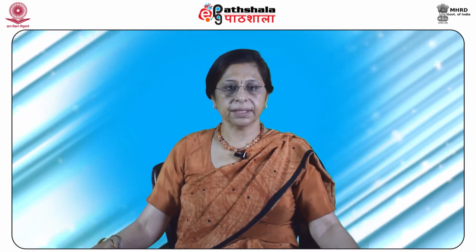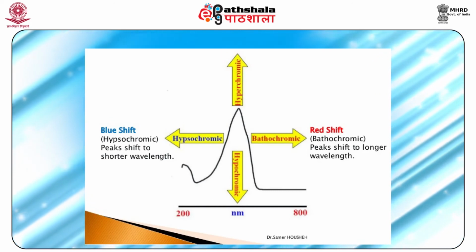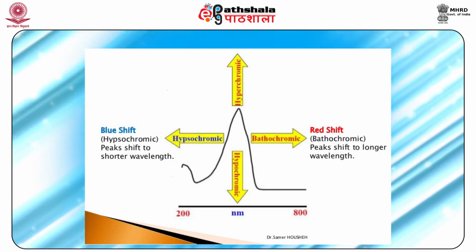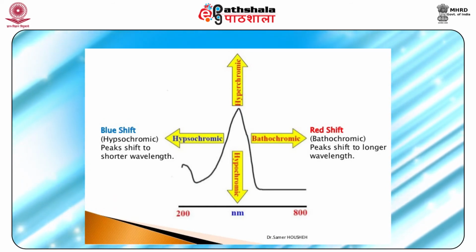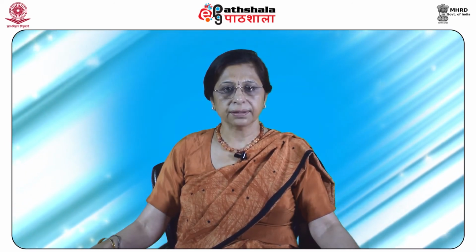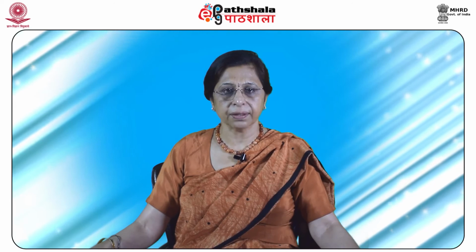Now, let us discuss the effect of conjugation on UV-visible absorbance. The presence of conjugation in a molecule always results in a bathochromic shift. The larger the extent of conjugation, the more will be the bathochromic shift. The presence of conjugation not only increases the absorption wavelength, but also results in an increase in intensity of absorption. The electronic energy levels come close to each other in the presence of conjugation, which results in a transition of lower energy or longer wavelength, as explained in figure 6.